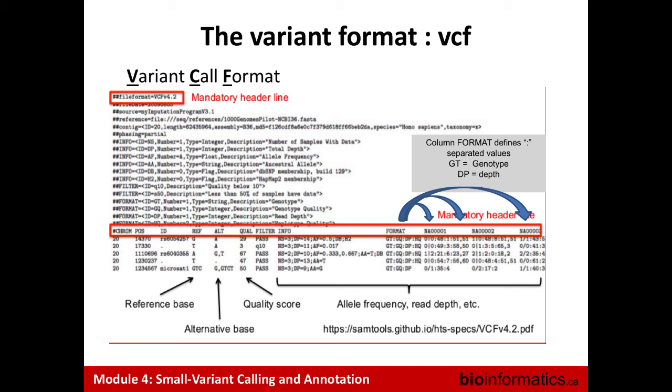You would still do multi-sample, but let's say 90 of them were really good, 6 of them were really low. Did you include the 6? Yeah. Because, as I say, it's a standardized sequencing experiment. So you just miss information. So try to get this information from the others. Use the others that have a lot of coverage to try to define where the good sites are. And then when you go back to the maximum likelihood, you will get what you get based on the coverage you've got. So maybe you will have a lot of false negatives, probably. But you will probably have more true positives than if you only separate the 6 and analyze the 6 independently.